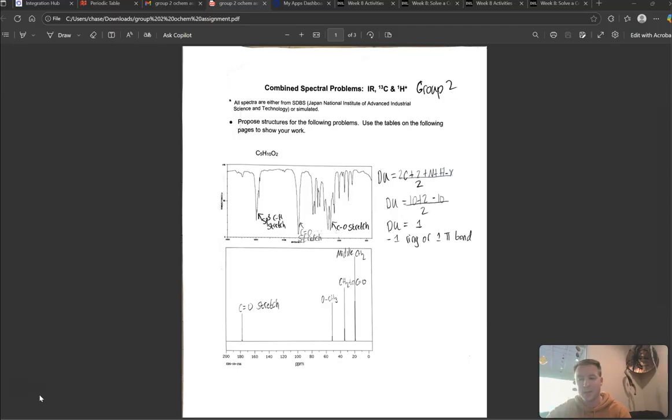Hi everyone, my name is Chase Minardi, and this is my Week 8 spectral elucidation video for Group 2. I'm going to walk you through how I determine the structure of my unknown using its IR, 13C NMR, and 1H NMR spectra, along with my calculation for the degree of unsaturation, and how all the data led to a single structure. So to start off, we're going to talk about our degrees of unsaturation.